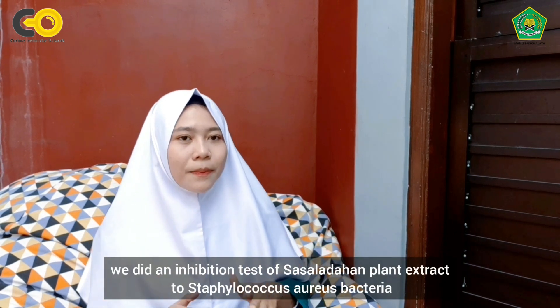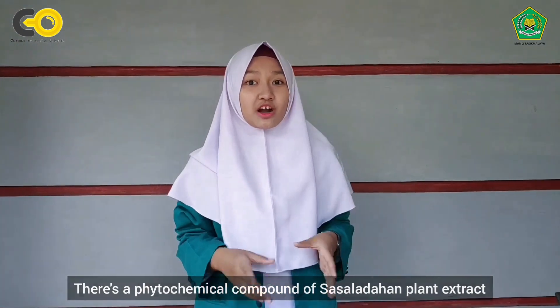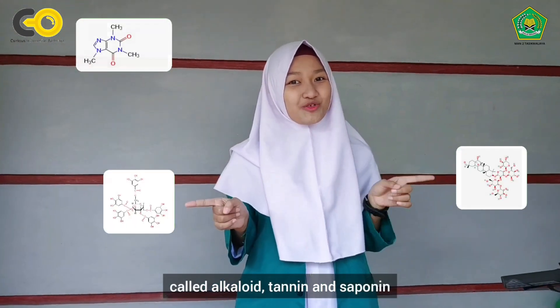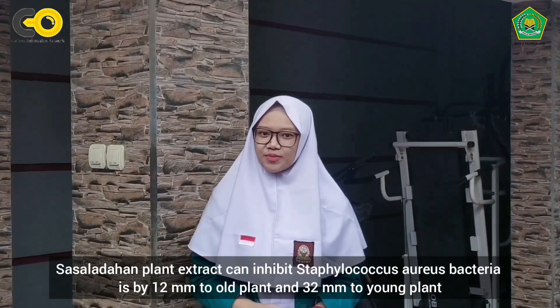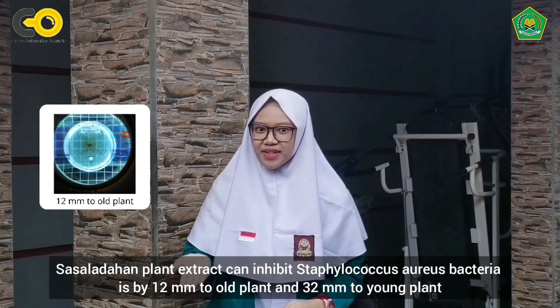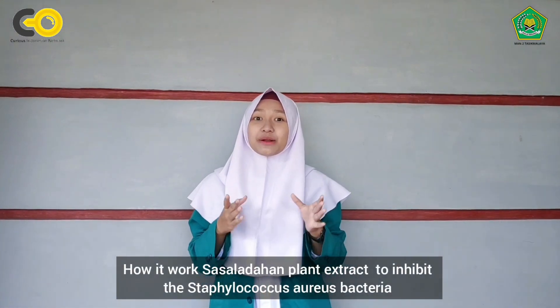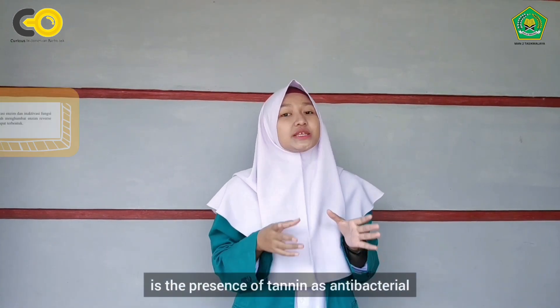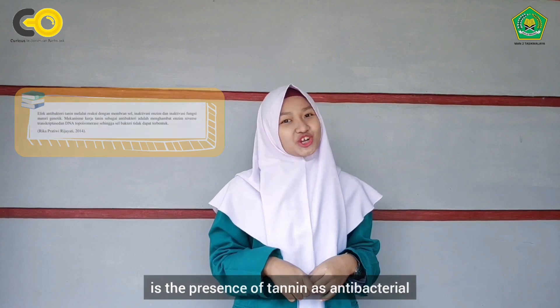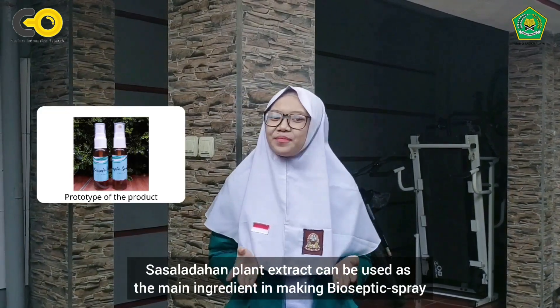For the last step, we did an inhibition test of sasala dahan plant extract on Staphylococcus aureus bacteria. The phytochemical compounds of sasala dahan plant extract include alkaloid, canin, and saponin. The extract can inhibit Staphylococcus aureus bacteria by 12 mm for the old plant and 32 mm for the young plant. It works through the presence of tannin as an antibacterial agent. Therefore, sasala dahan plant extract can be used as the main ingredient in making bioseptic spray.